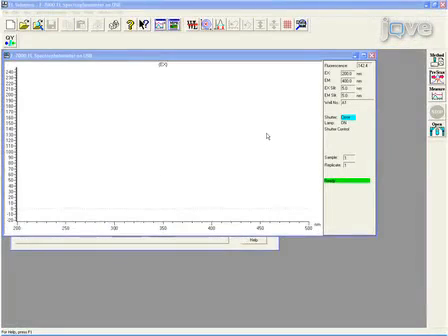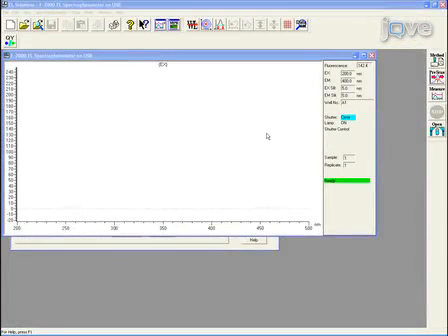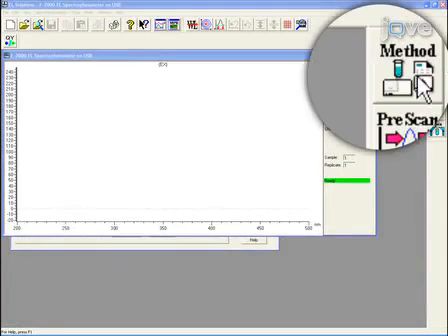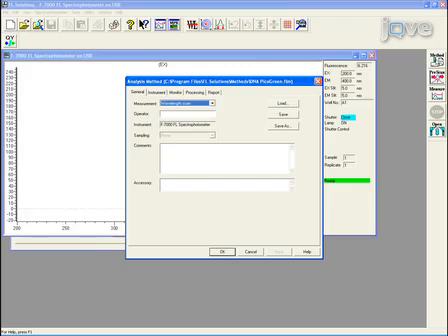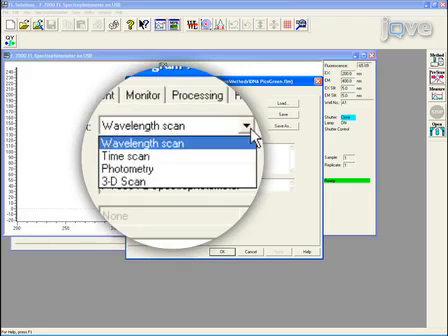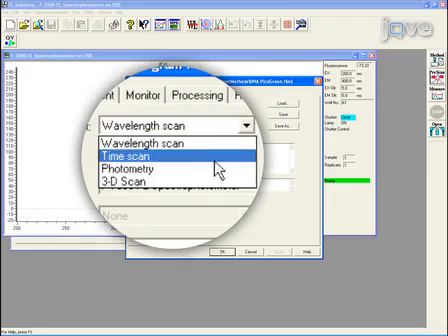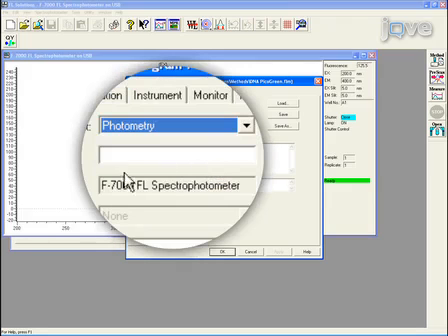To set up the fluorometer, first click on the method button that opens the analysis method window. In the measurement field, select photometry from the pull-down menu.